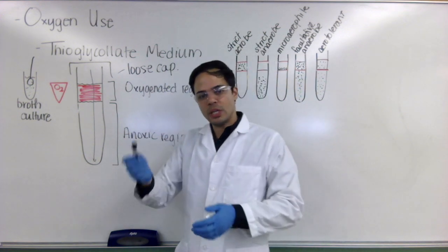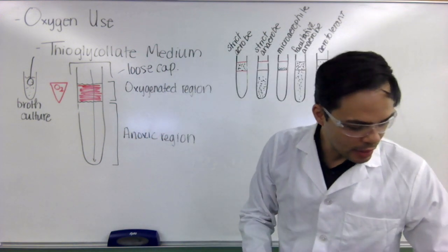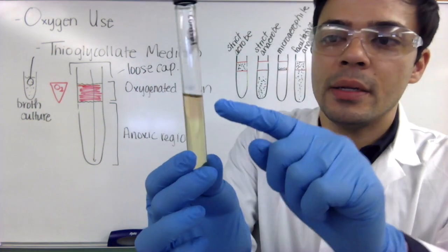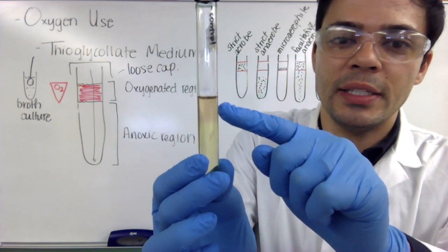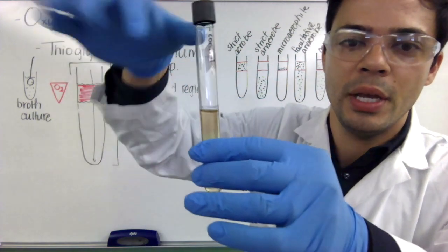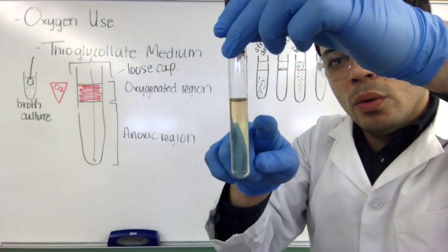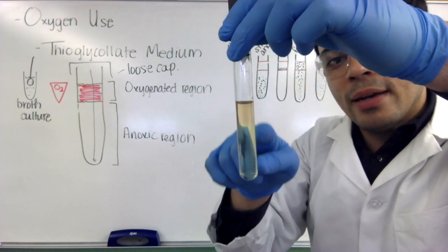And then you take the tube between your hands and for example here is one of those tubes and actually you can see the gradient of the resazurin at the top where we have the oxygenated region and then the region at the bottom here where we have the deoxygenated or anoxic region.